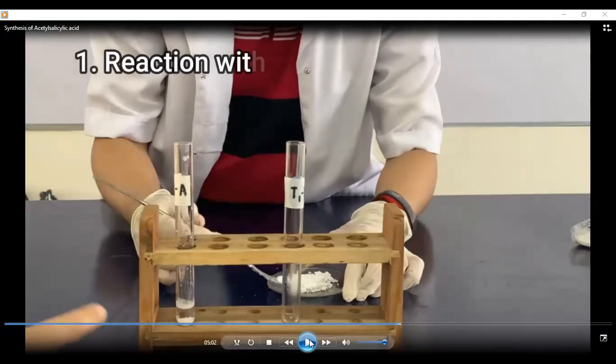This first chemical test is the reaction with ferric chloride solution. In reference to the previous experiment, the synthesis of salicylic acid, we also had a chemical test for reaction with ferric chloride solution. The ferric chloride test is used to detect phenols, phenolic compounds in solution.